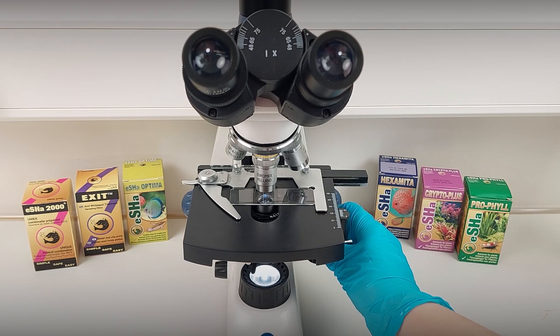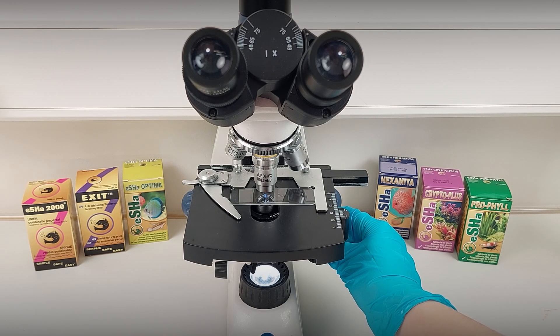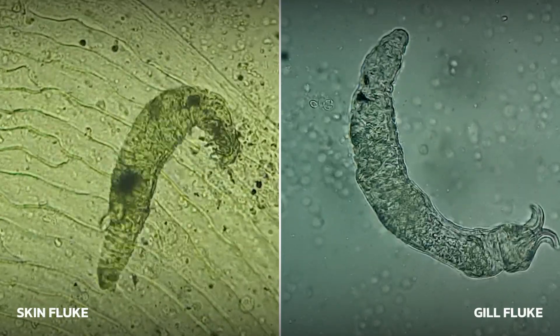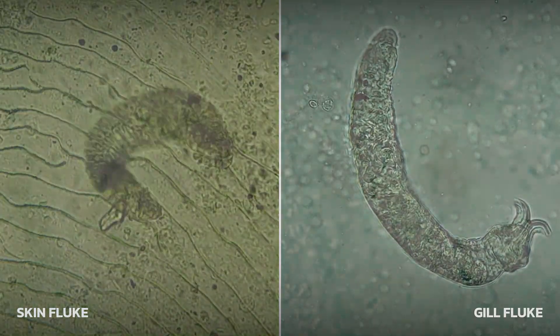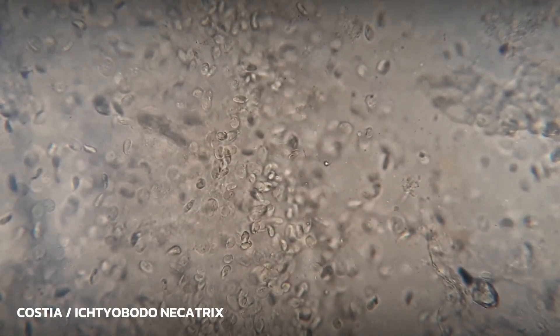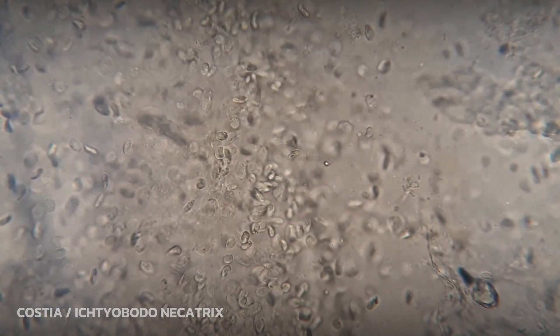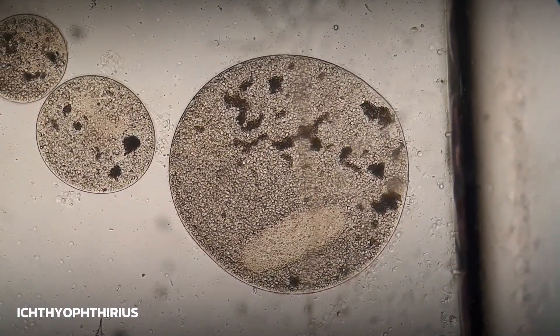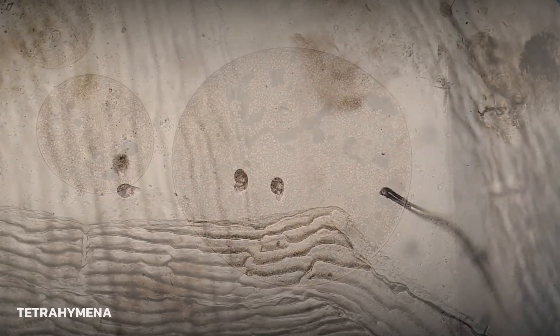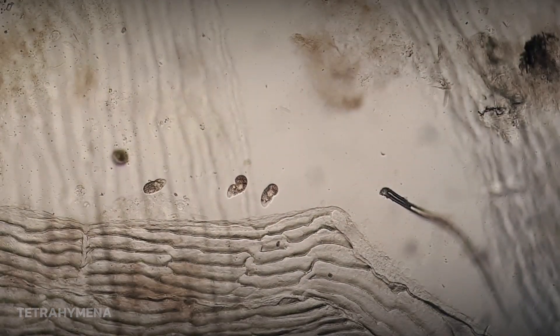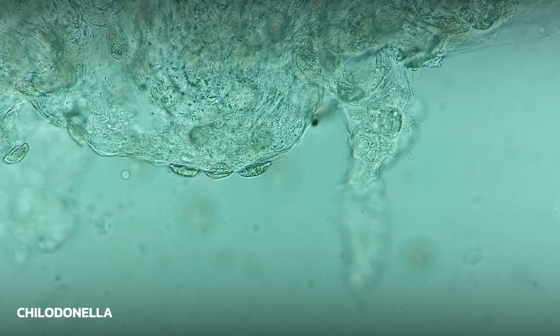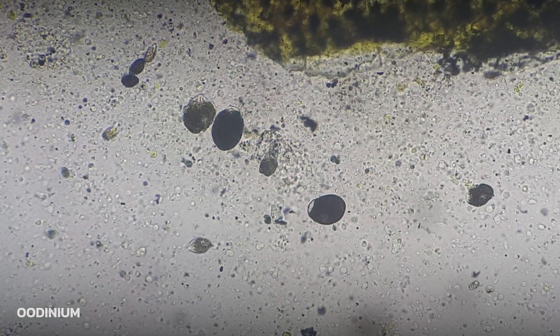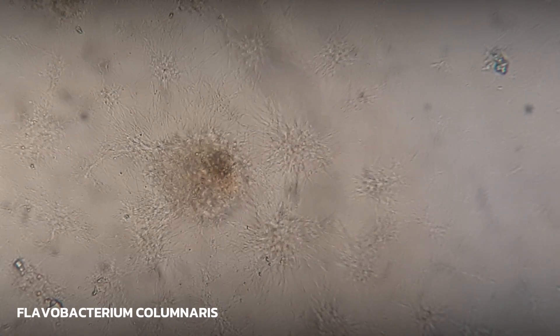Some parasites will stop moving after about 5 minutes. The main parasites you can find with the skin scrape are Gyrodactylus, Costia or Ichthyobodo necatrix, Trichodina, Ichthyophthirius, Tetrahymena, Chilodonella, Oodinium, and Flavobacterium columnare.